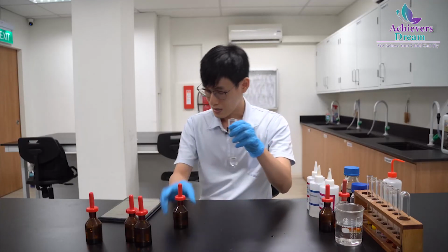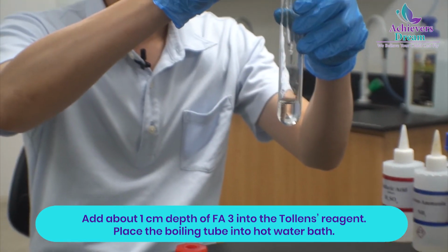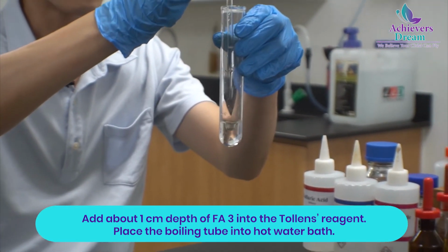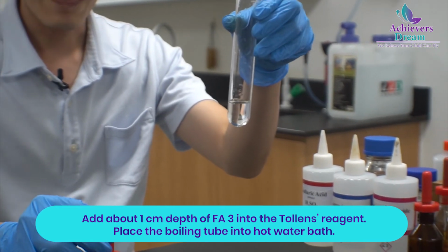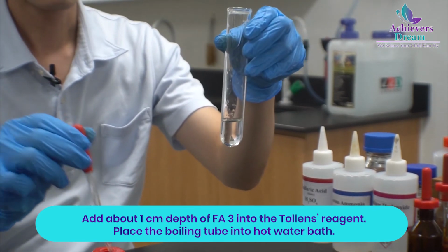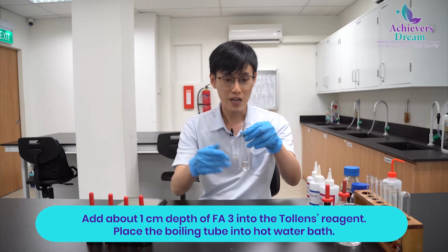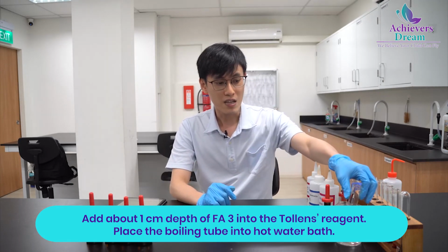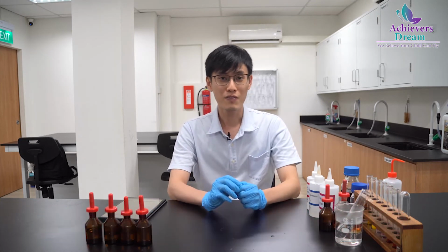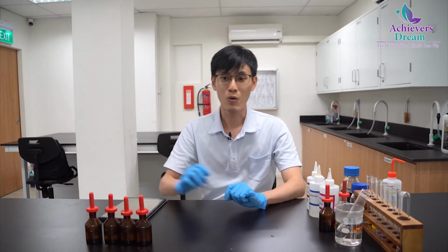So we'll be adding Fa3, about 1 cm depth of Fa3 to our Tollens' reagent. Tollens' reagent tests for the presence of an aldehyde group. If we have an aldehyde in Fa3, what we expect to see is a silver mirror. Tollens' reagent is an oxidizing agent, so it oxidizes the aldehyde. That reaction needs energy, so I'll be placing the boiling tube in my water bath right here. Oxidation of aldehydes involves breaking of strong covalent bonds. That's why heating is required.